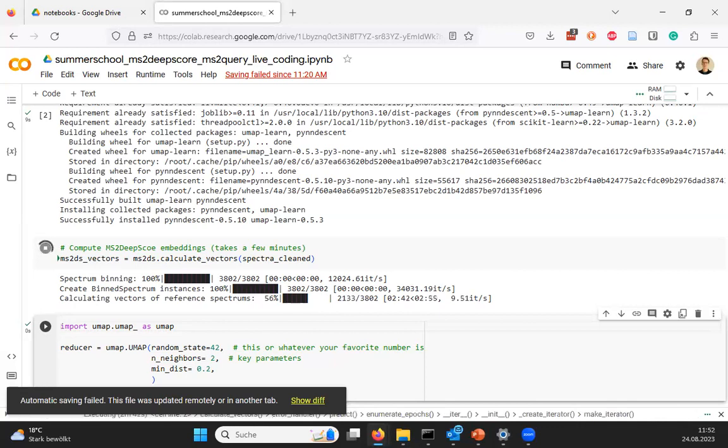Now that we have time, I should also mention another thing. We trained this network that we're using here with GNPS. So what it can do well, I assume at least, is predict chemical similarities between compounds that are often found in GNPS. But the more exotic the compounds get, the more rare they are or the more different they are to the standard of what you see in GNPS, the less I would trust these predictions. But I guess that's a problem with all data-driven tools, that you rely on the data that you can train on.